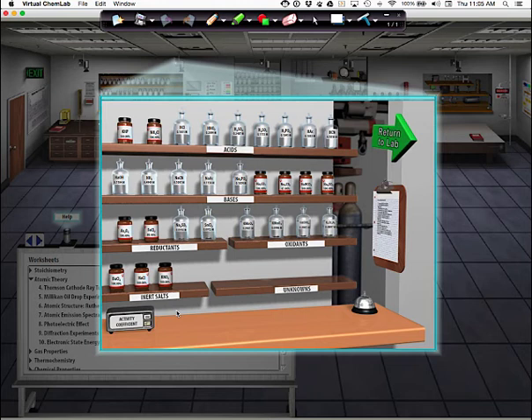Here's all the acids, here's all the bases. Guys, this stuff down here, the reductants and the oxidants and the inert salts are actually chemicals that you need for a completely different type of titration. You're welcome to fiddle around with them if you want to, but understand this isn't what we're doing. Okay, so then guys, it says this, step 5. Place the nitric acid on the counter. Now guys, I'm not going to do nitric acid because that's what you're doing in lab. So I'm going to grab the hydrochloric instead.